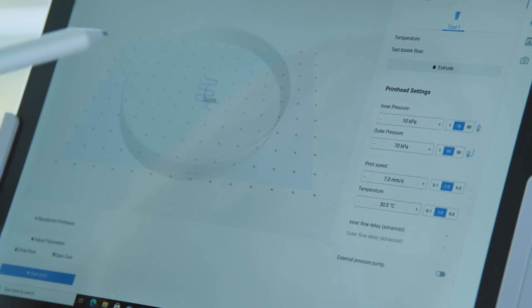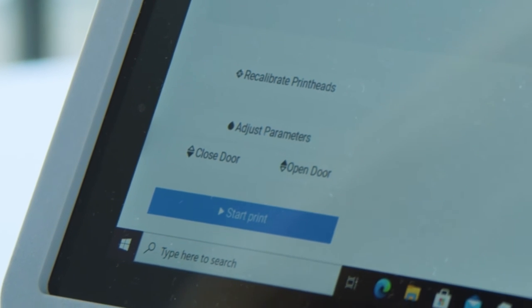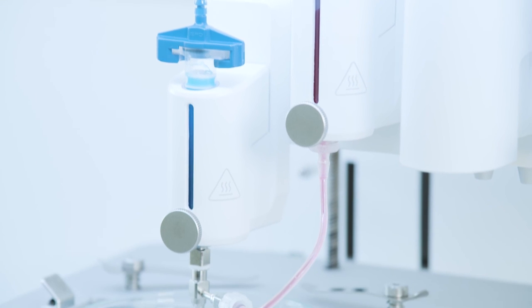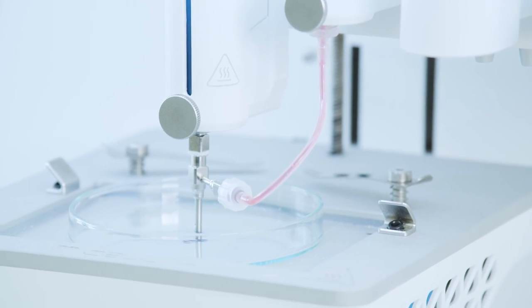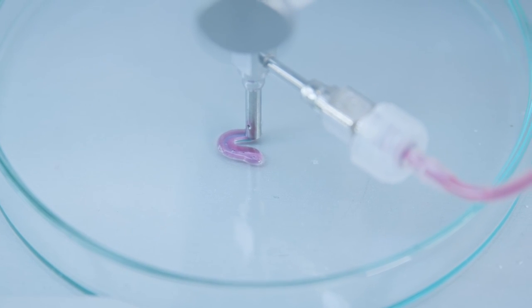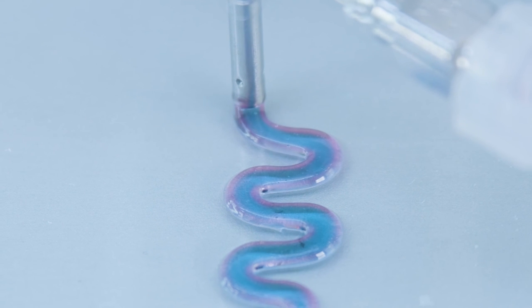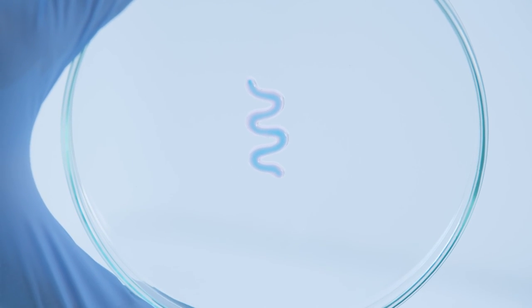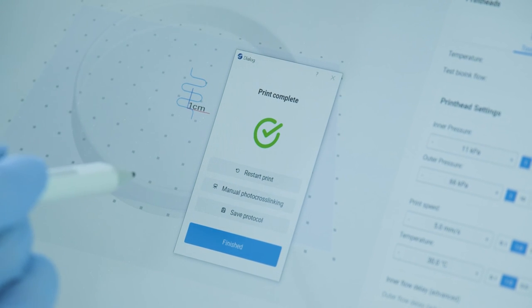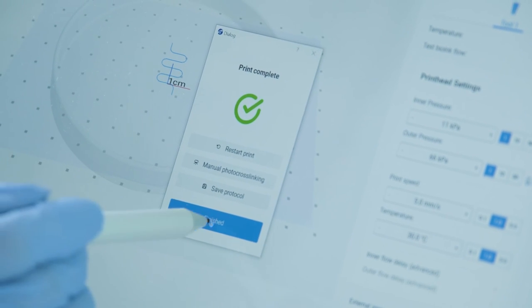The settings are ready to print. Now start print. As you can see clearly, the inner layer is in blue and the outer layer is in red. After printing, you can save your protocol, go through the crosslinking process based on your bioinks, or restart printing.